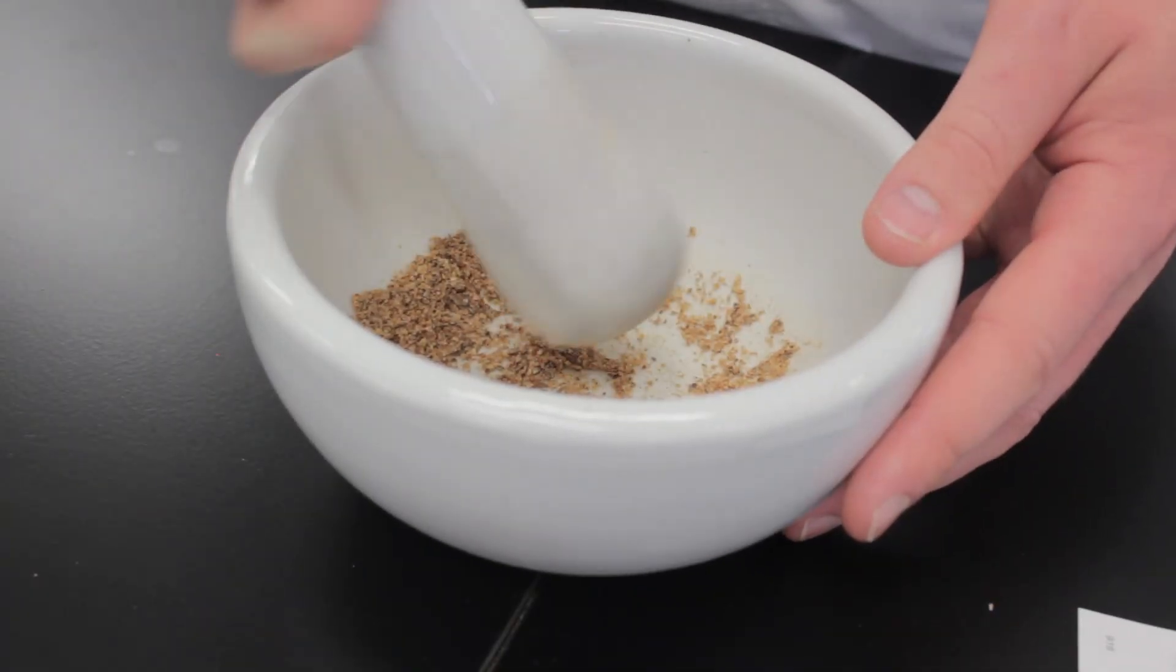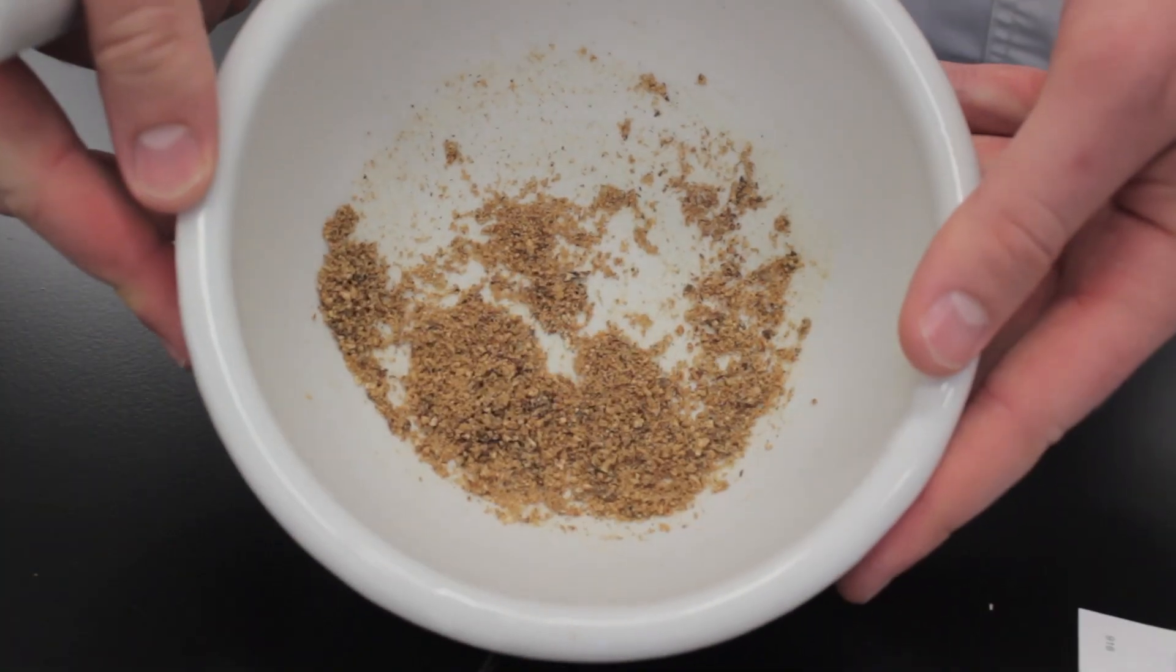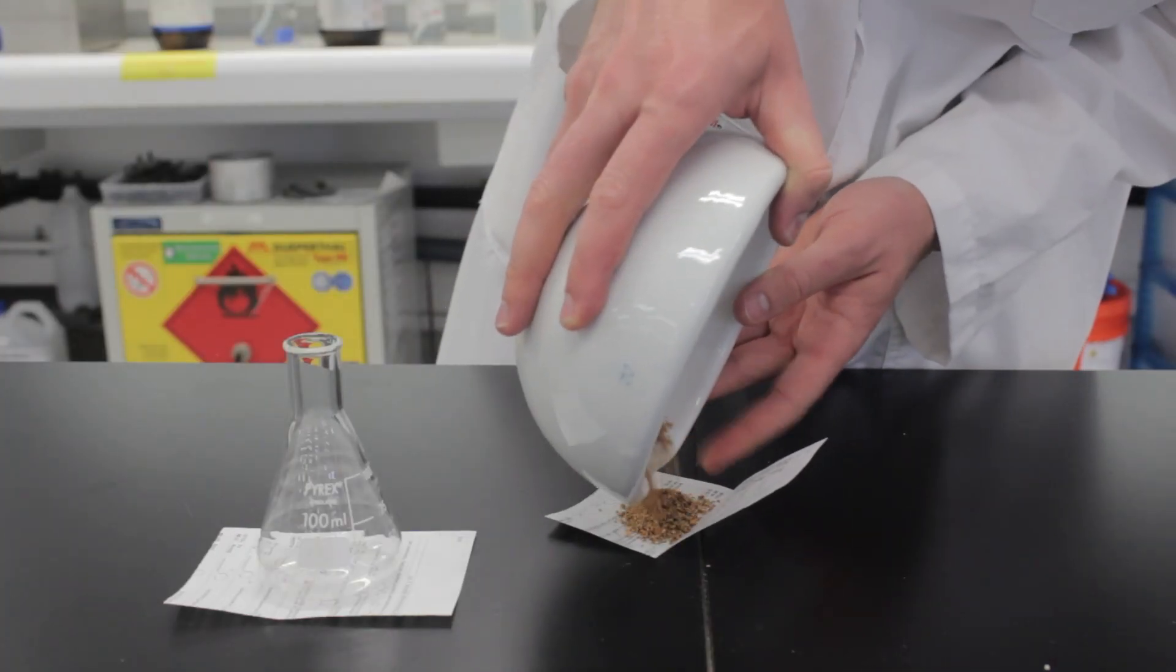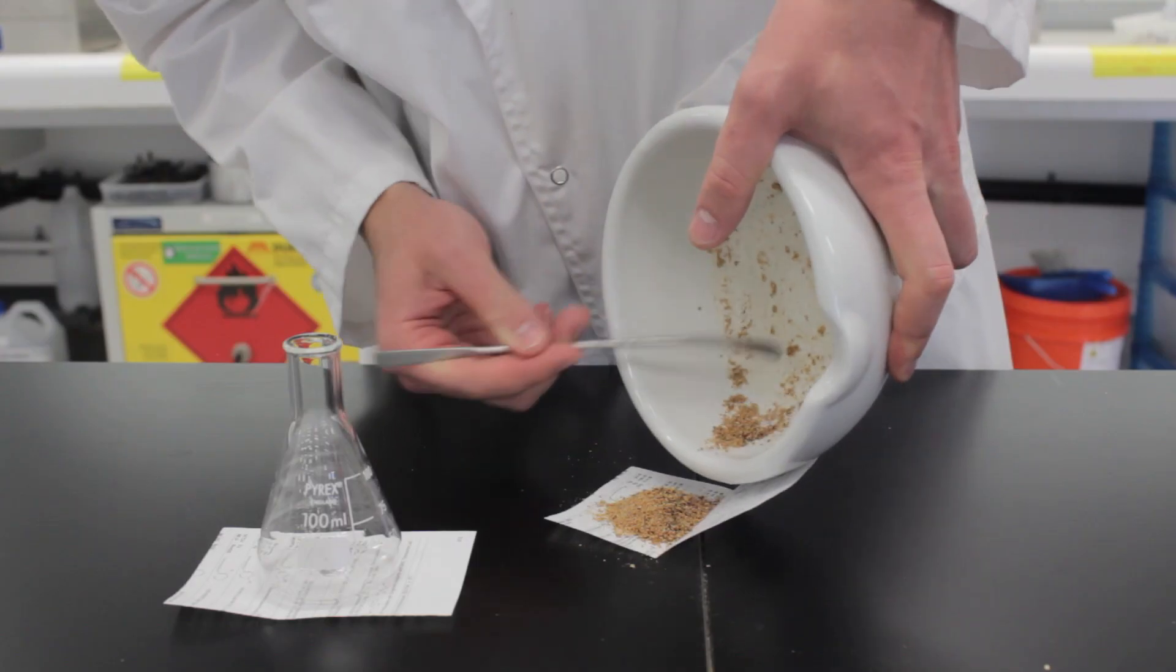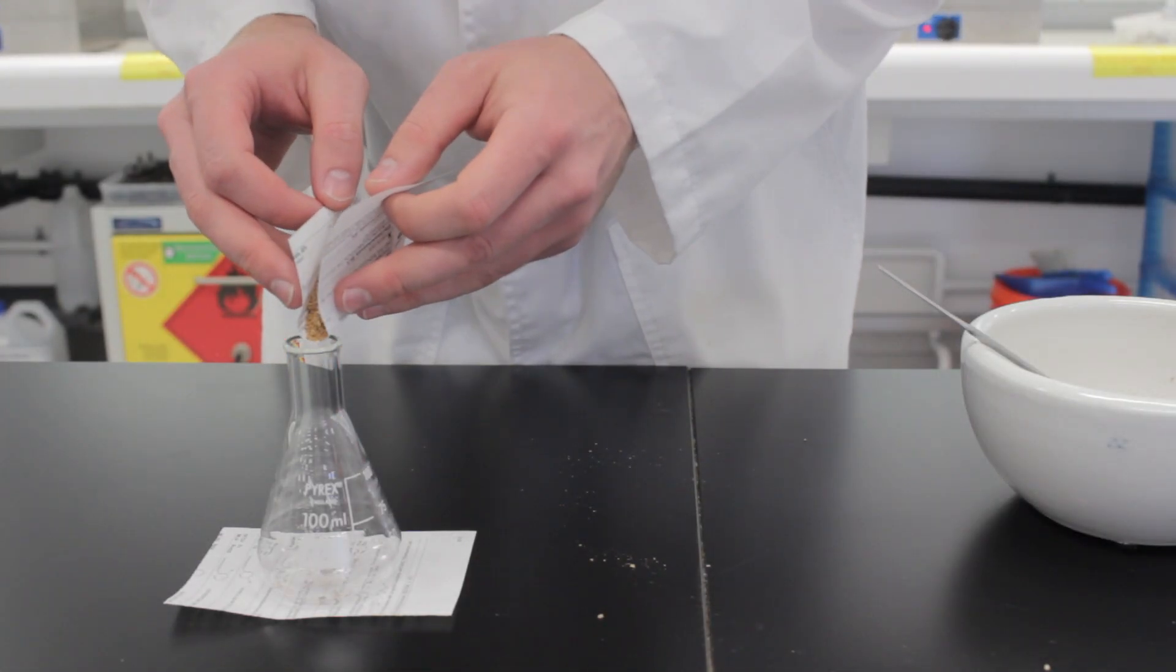Make sure there are no huge chunks then transfer your powder to a 100 ml conical flask. First tip it out onto a weighing paper using a spatula to scrape off anything that's stuck on the mortar. Then fold it into a cone and transfer it into your flask.